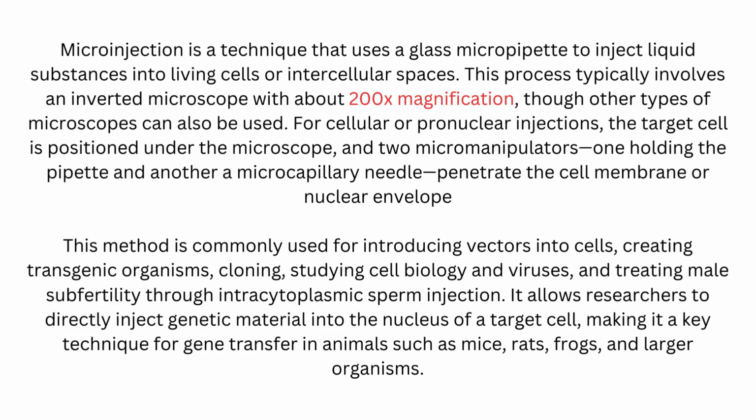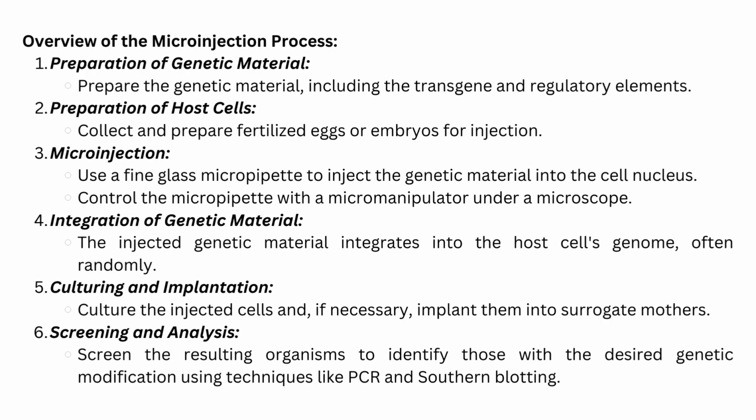It allows researchers to directly inject genetic material into the nucleus of a target cell, making it a key technique for gene transfer in animals such as mice, rats, frogs, and larger organisms. Overview of the microinjection process.